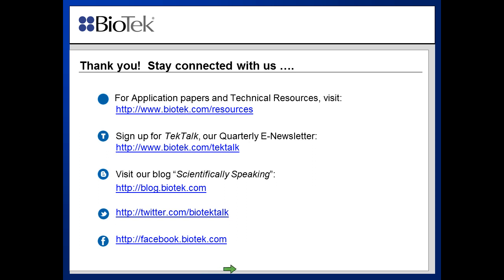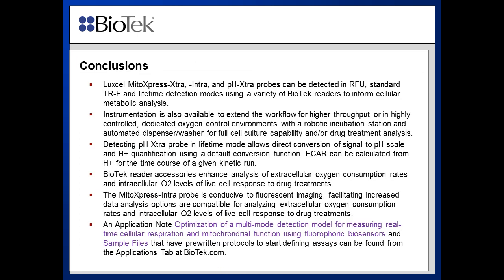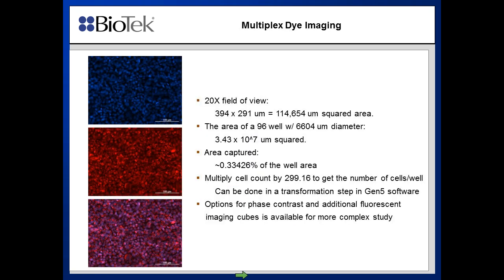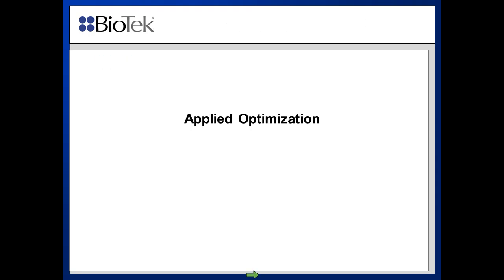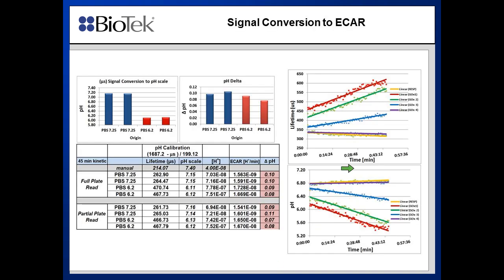I think that's to answer that one. And a final question was, can the measurements be done at 5% oxygen? And how sensitive is the system at 5%? The answer is, the lower the oxygen concentration, actually performance goes up. And as you've seen, Wendy has used the probe at lower oxygen concentrations. So the answer to that question is a short yes. So I think that summarizes most of the questions that have come in, but as we're tight for time, we're just not able to get to them all.